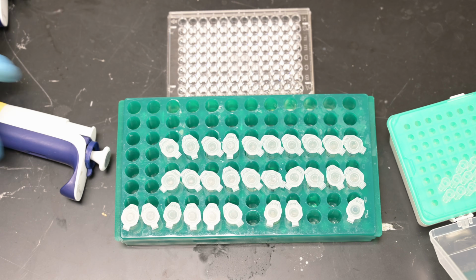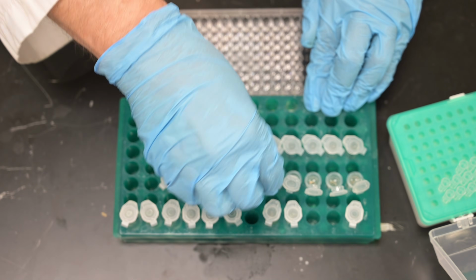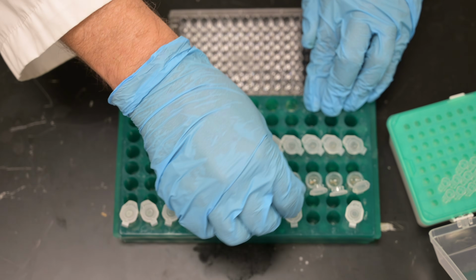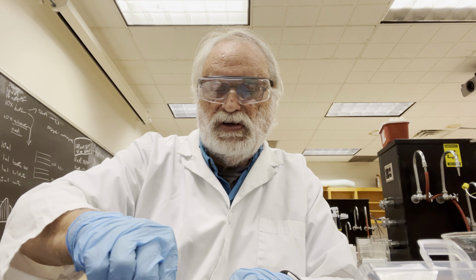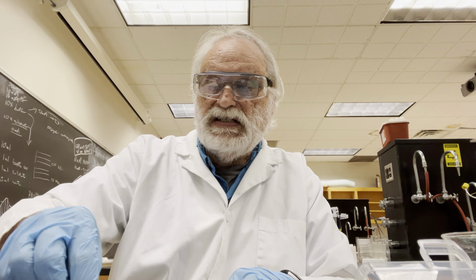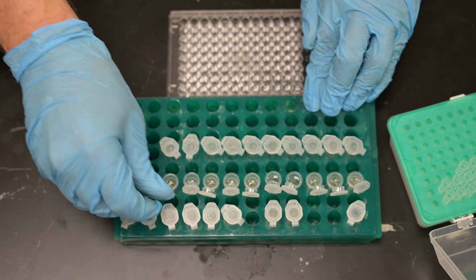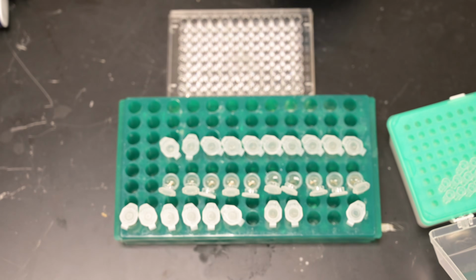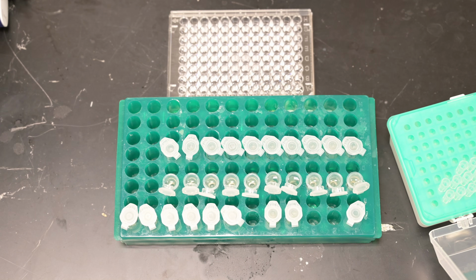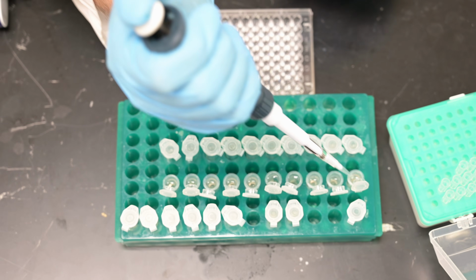Okay, the next step along the way is to do the wash, in which we wash the load material off and make sure everything binds. Then we did 3 steps of elution, a 0.1, a 0.3, and a 0.5, and these are all the 0.1s. So I will add those, and they go into B1 to B10.